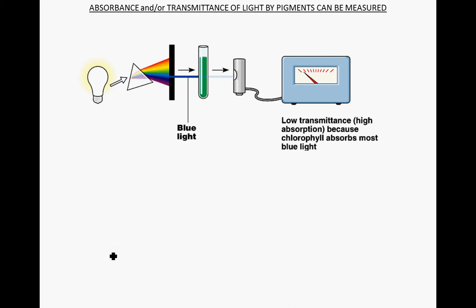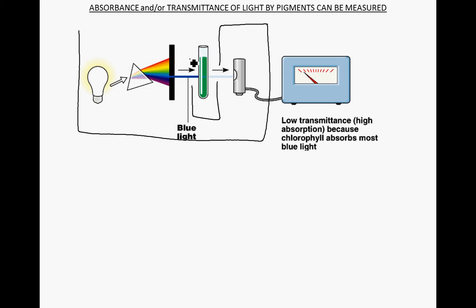So we're going to use a colorimeter, and if we were to take that box that's the colorimeter in our lab and section it, this is what the box is going to look like. There'll be a light source inside here, and there's a knob on the top that can switch which wavelength of light is being fired at our sample.